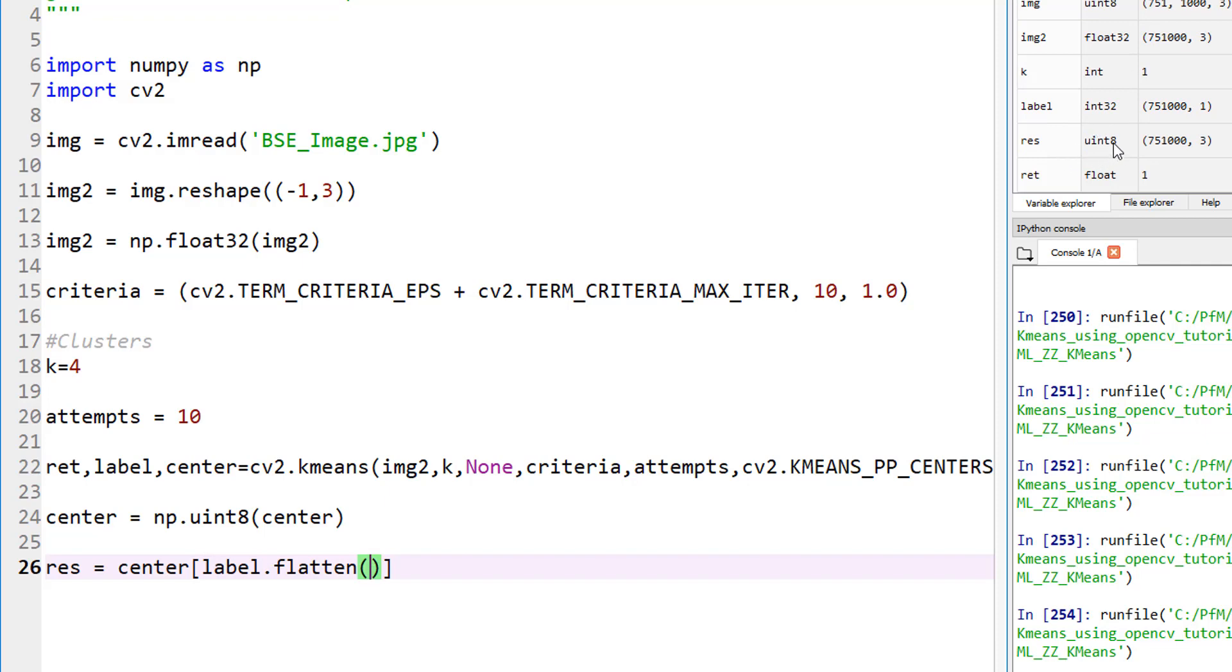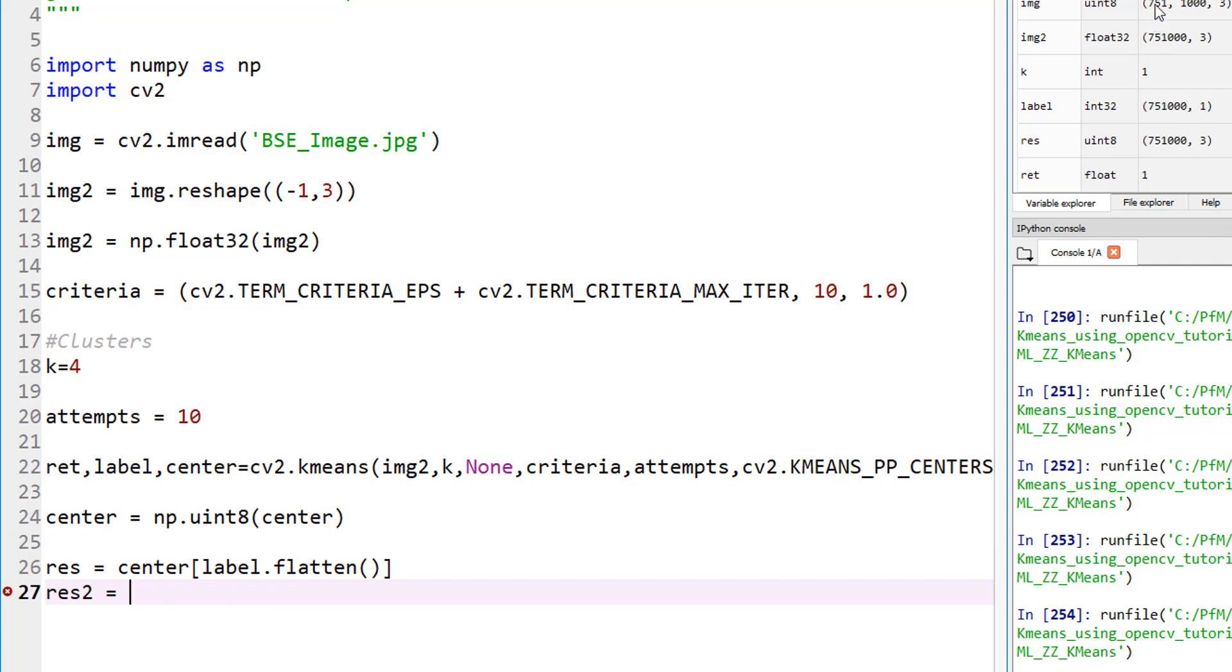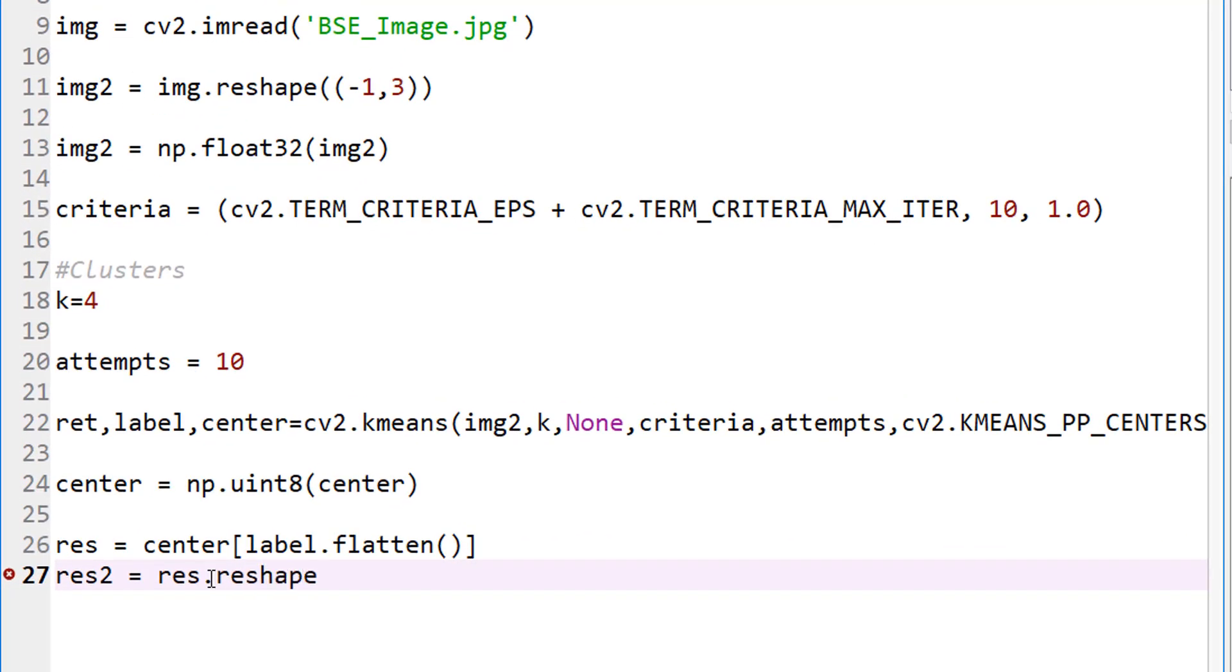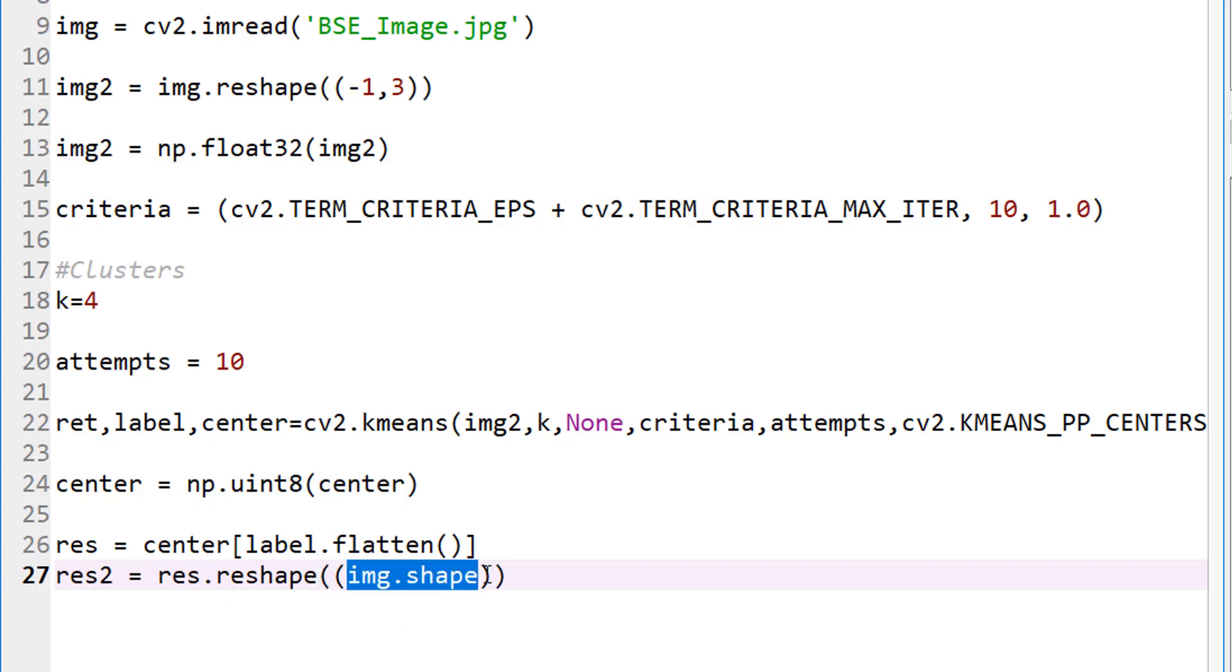Let's run this until now so we can see what res looks like. This is unsigned integer 8. This is nothing but the flattened label right there. Now we have 751,000 by 3 over there. Right now I'm reshaping it so it looks like an image. This is just a flattened array. Let's make this into an image, which should be 751 by 1,000. How do we do that? We take this and reshape it into our original image shape. Reshape into our original image, IMG, look at the shape and reshape it into that shape.